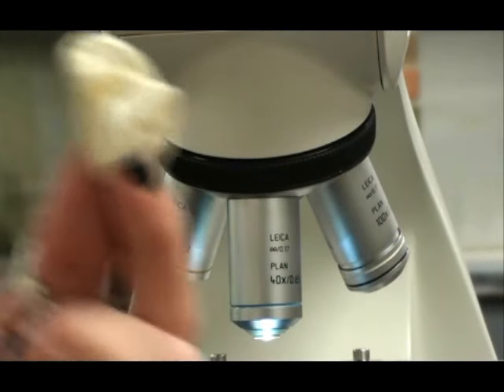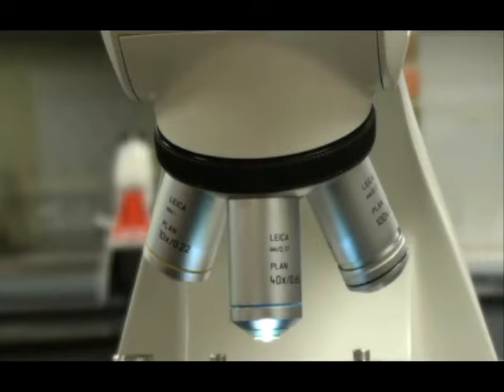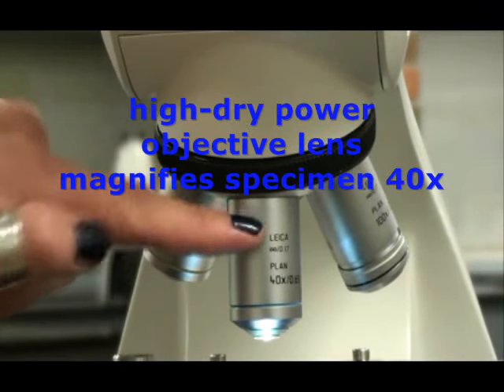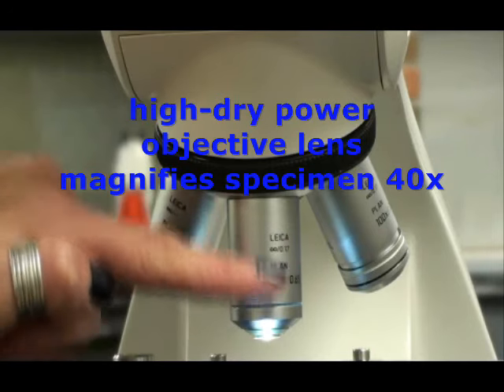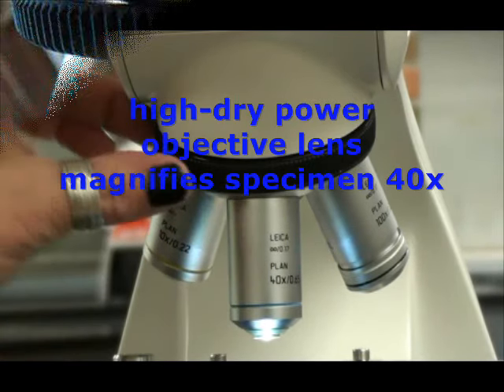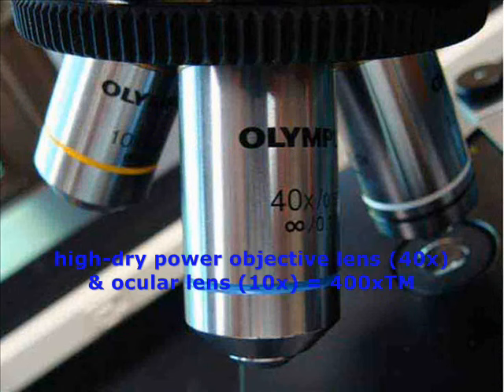But for now, we need to uncover the lens and take a look at it. I can dispose of that finger cot, and now I can see my high dry powered lens. This lens magnifies specimens 40 times actual size. But again, I'm always looking through the ocular and the objective at the same time. So my total magnification at high dry power is 400x.